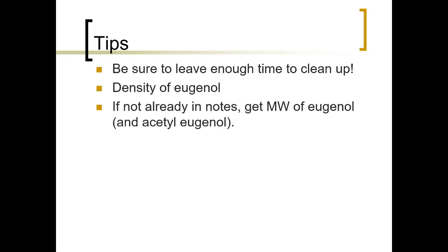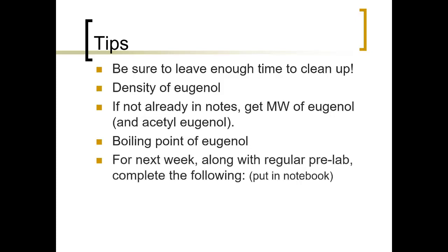Make sure that you get your molecular weights of your eugenol and your eugenol acetates into your notebook before you come back to lab. Make sure you look for what the boiling point of eugenol is before you come to lab. Make sure that you complete any pre-lab work in your notebook before you come back to lab the previous week so that you can get ready to do everything.